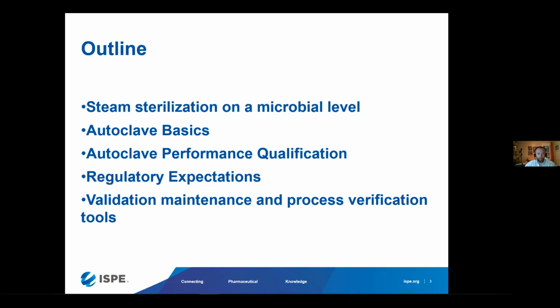And then we'll talk about some regulatory expectations. These are global expectations. It's good right now in our industry with regards to autoclave performance. The regulatory expectations have been harmonized by and large. I'll call out some new regulations and some focus points that I feel are being looked at a little bit more during audits and such. And then lastly, to help us with these regulatory expectations and to help meet the performance qualification goals, we'll talk through some validation maintenance best practices.